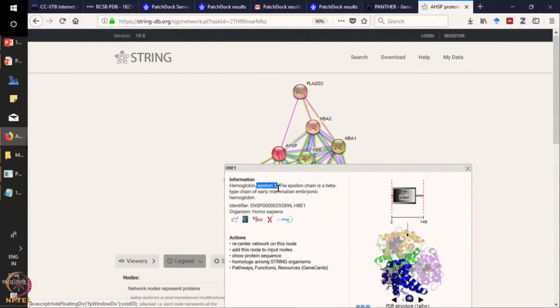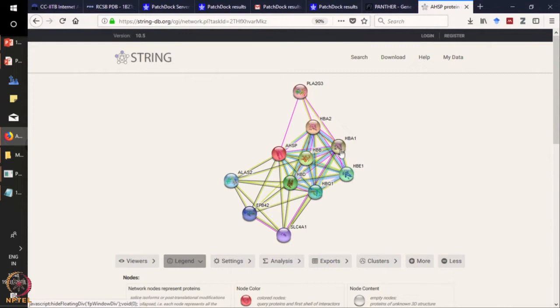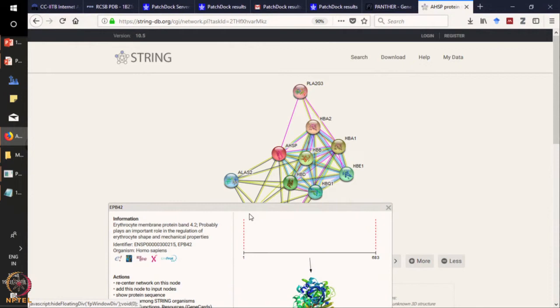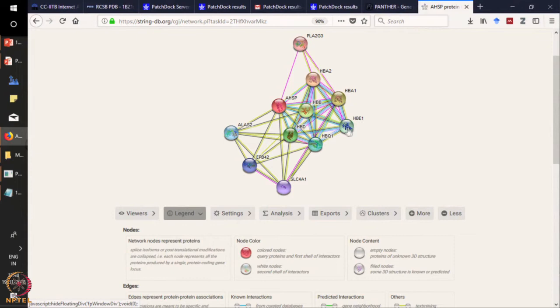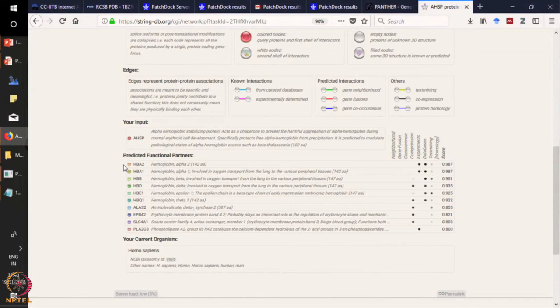This is another molecule of hemoglobin — the epsilon chain. If you want to know interactors that are interacting in a more distant way, meaning interacting through other partners, you can click on those molecules. For example, this is also a protein related to the blood — erythrocyte membrane protein band. In this way you can query for one protein and get to know a lot of other interacting partners through STRING.